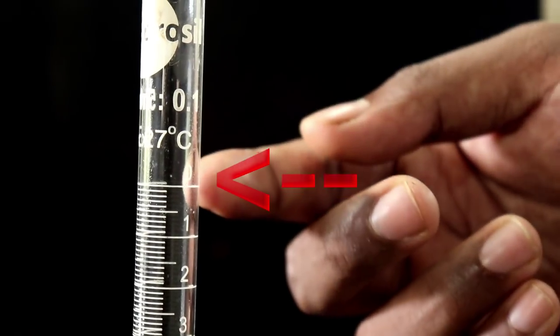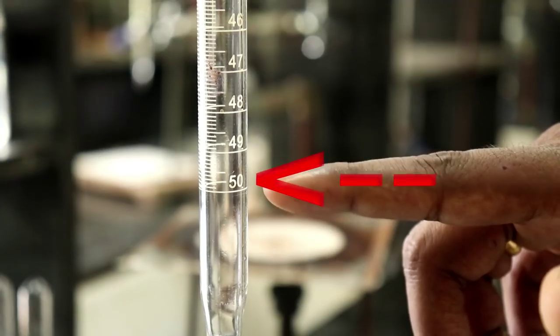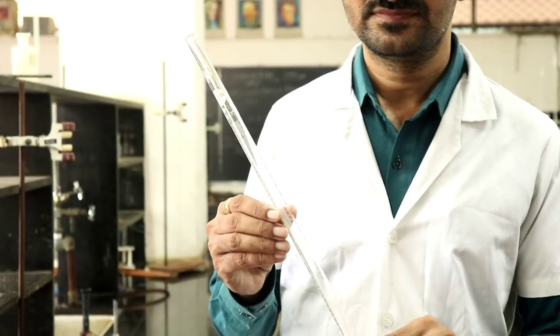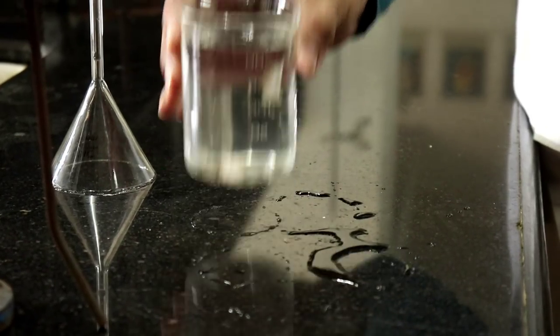There is a zero mark at the top of the burette and a 50 ml mark at the bottom. The burette is to be read from top to bottom.